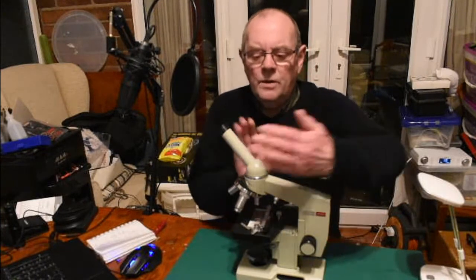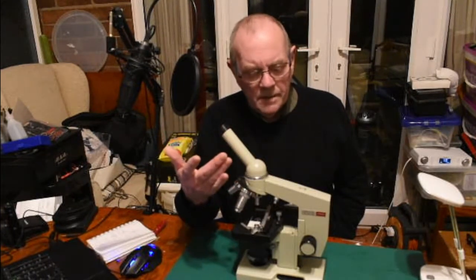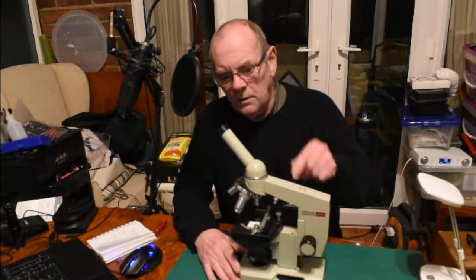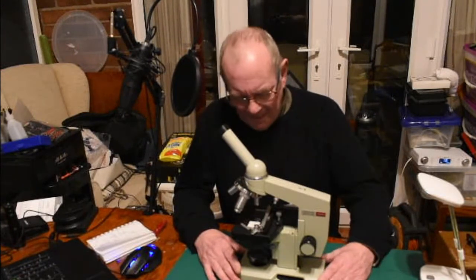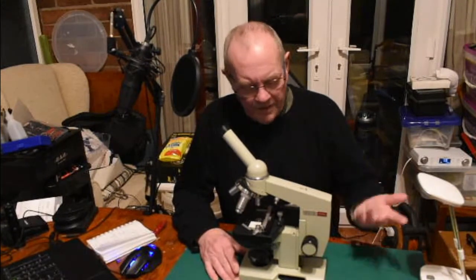Some microscopes come with binocular vision — two eyepiece lenses. Unfortunately most of these Soviet models don't; they do make a twin model but I haven't been able to find one. I've got used to using one eye and it's really not a big deal for me.